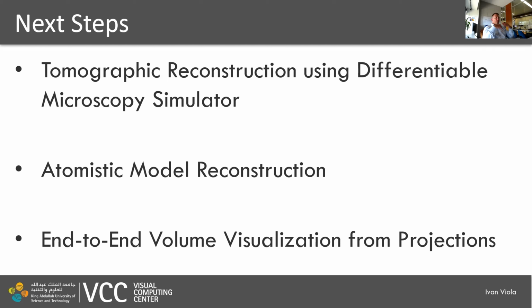So basically we create a learning-based pipeline which does this all jointly, where the input will be the Cryo-ET projections, and the output will be vivid and noise-free 3D visualizations of that data.